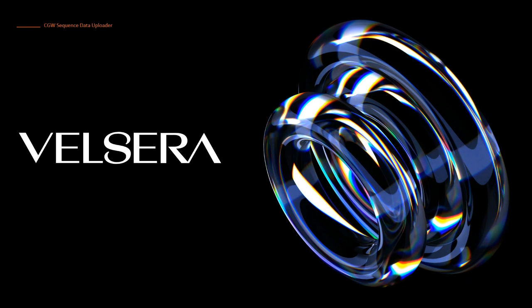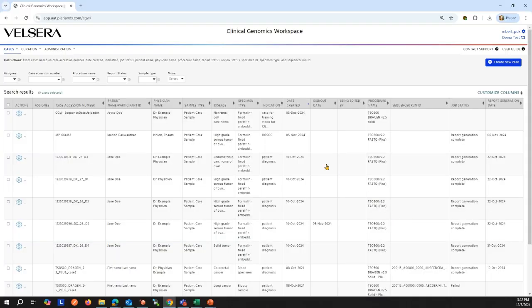Hello, today I'm going to speak with you on using the CGW Sequence Data Uploader. Let's first start by going into CGW.